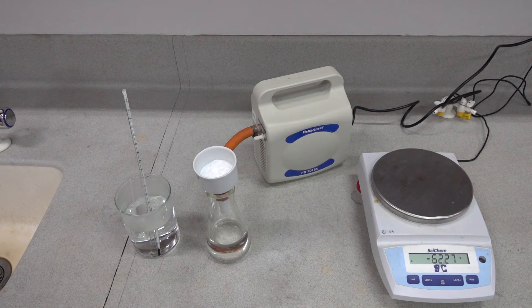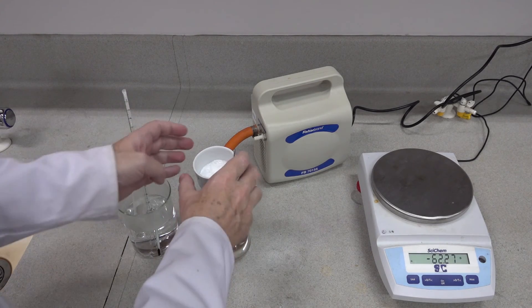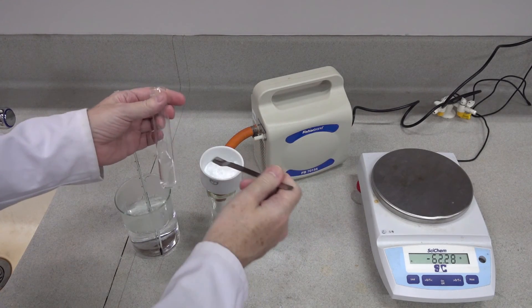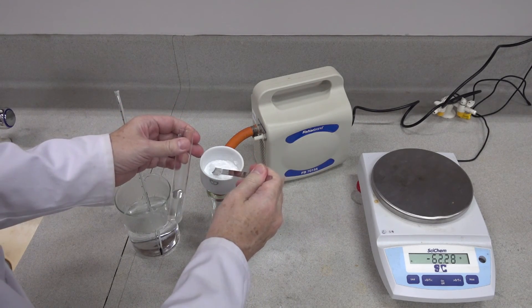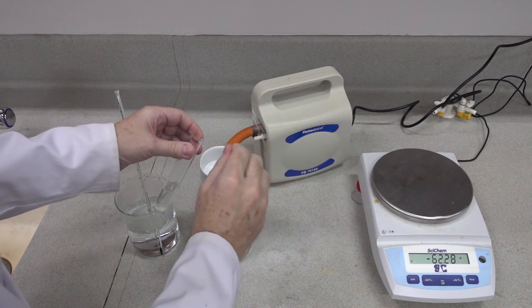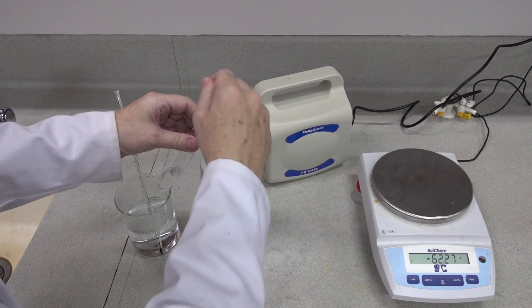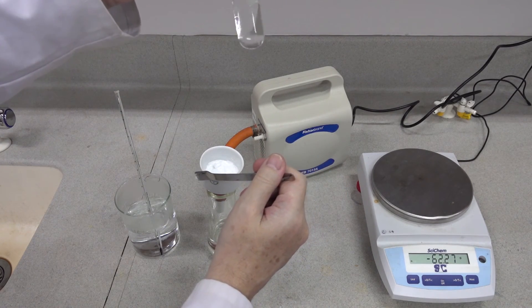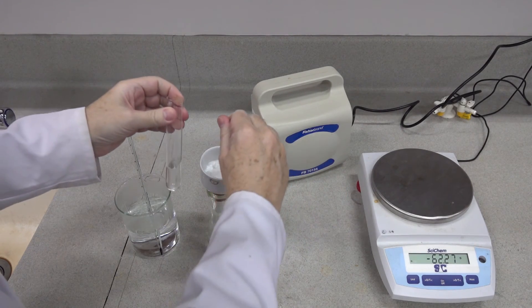The next part is to add the crude product to the ethanol once it gets up to temperature. We're asked to avoid scraping any paper, so you just scrape in your crude aspirin. You can see as it's going in it is in fact dissolving in the ethanol, which is what we want.